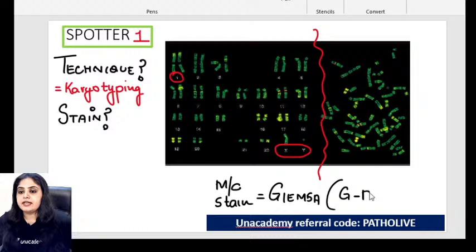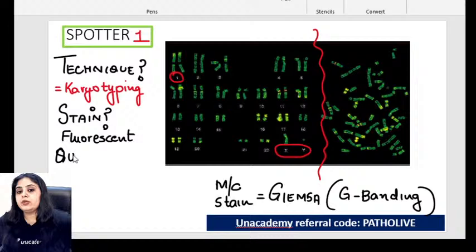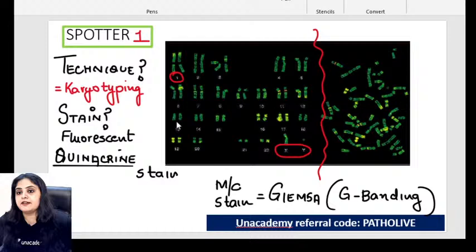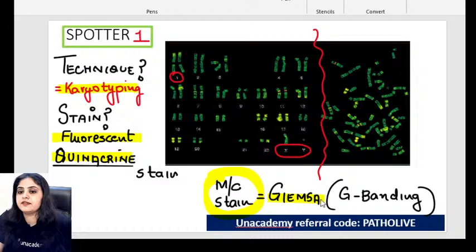Over here it's obviously not the Giemsa stain — I've used a fluorescent stain. The fluorescent stain used here is the quinacrine stain, which many of you correctly identified. Quinacrine is a fluorescent stain, giving that greenish fluorescent color. The microscope used is a fluorescence microscope. The usual common stain for karyotyping remains Giemsa. So: technique is karyotyping, stain is quinacrine, microscope is fluorescence microscope.